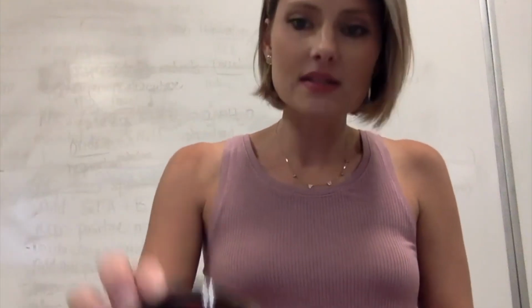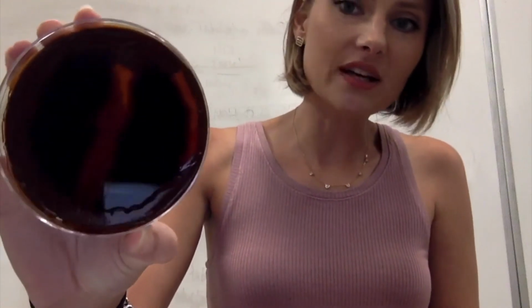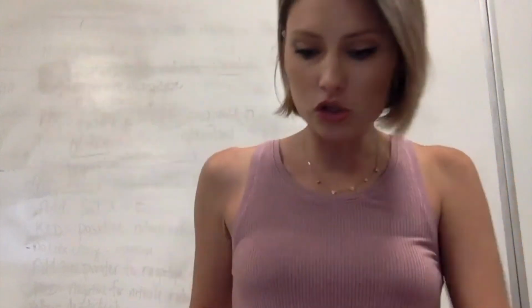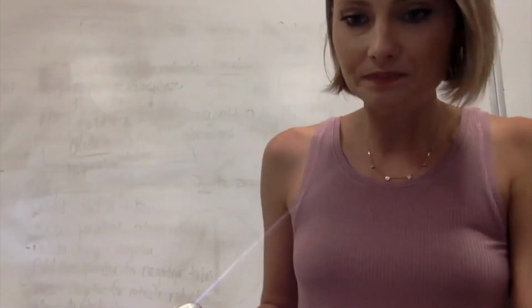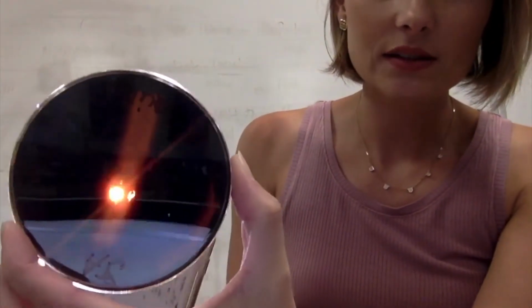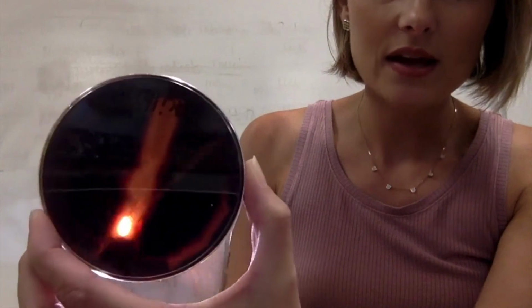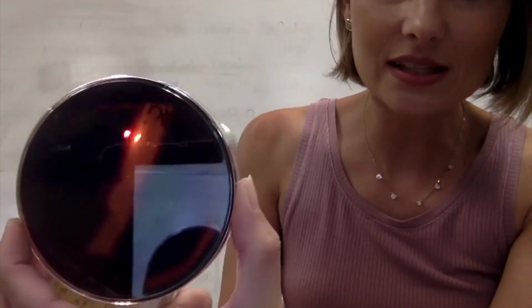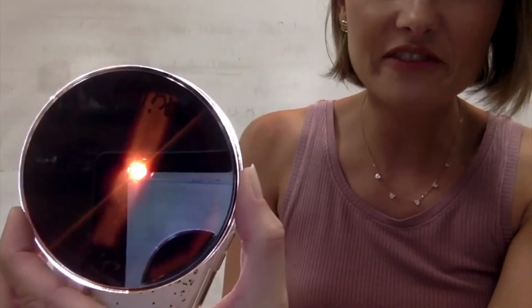Here's my Bacillus. Whoa, look at that. Do you see the clearing? I'm going to use my phone flashlight again. Look at that clearing. That means that this is Bacillus, and Bacillus is positive for amylase.